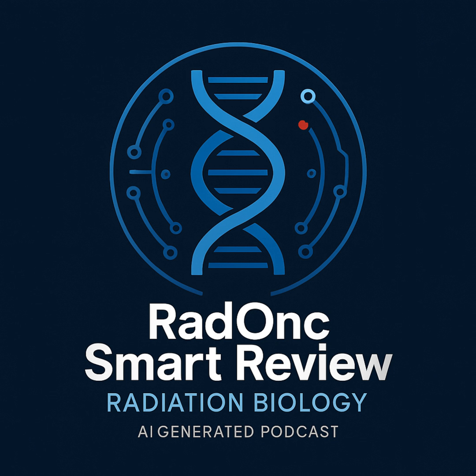What if you want a broader view? You could use ChIP-chip, which involves hybridizing the ChIP DNA to a microarray containing probes for many genomic regions. But the most common and powerful method now is ChIP-seq. You take all the DNA fragments you purified from the ChIP experiment and sequence them using next-generation sequencing. Ah, using NGS again. Yes. Then you map all those sequence reads back to the genome. The regions where lots of reads pile up indicate the sites where your protein was bound. This gives you a genome-wide map of binding sites.